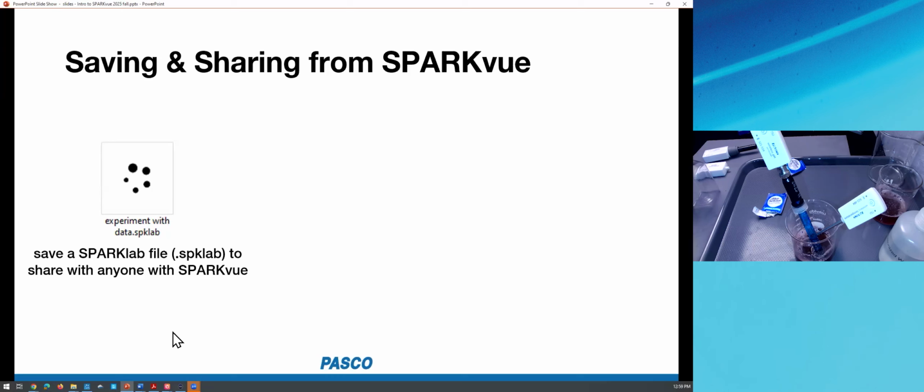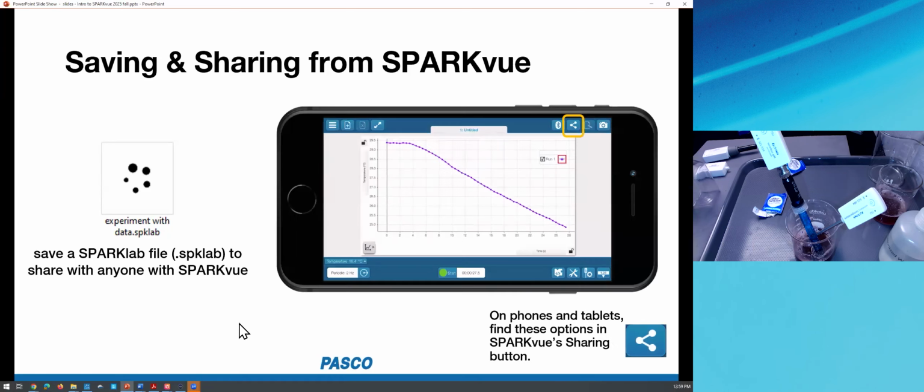Stephanie asks a very timely question. Will it save your files if you're using an iPad? The answer is yes. Generally speaking, mobile devices like tablets and phones are increasingly having file systems, but they don't quite have the same robust file systems that computers have. So in that case, you're probably interested in this sharing button. The sharing button that you'll find on an iPad, iPhone, Android tablet, Android phone, would allow you to essentially share the SparkLab file using the share sheets built into, in this case, iPad OS. And that would allow you to save the SparkLab file and share it to a Google Drive, email, message, whatever sharing techniques you use via the share sheets. Great question, Stephanie, and timely.